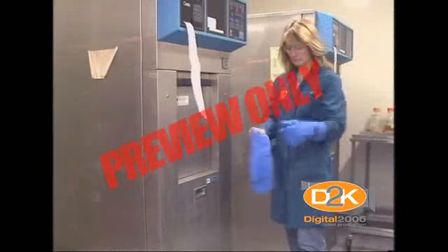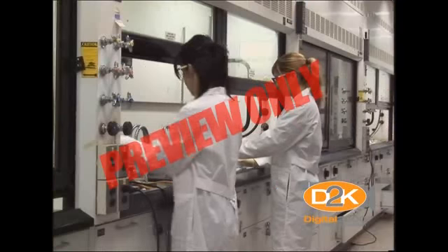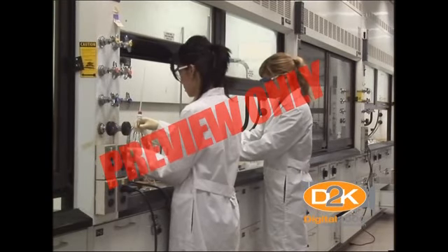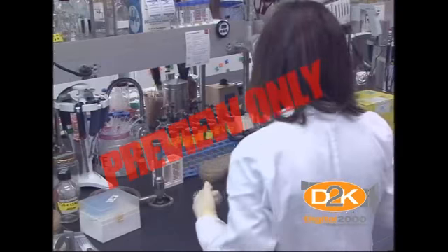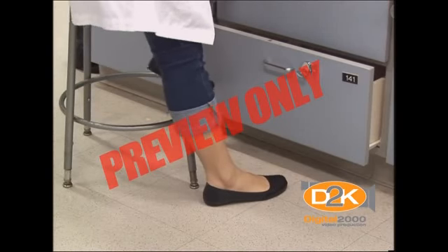Our next topic is personal protective equipment. You may see this written as PPE in safety documents. PPE must be provided to and worn by all laboratory personnel, students, and visitors when entering or working in a laboratory. At a minimum, a lab coat, gloves, eye protection, and closed-toed shoes are required.